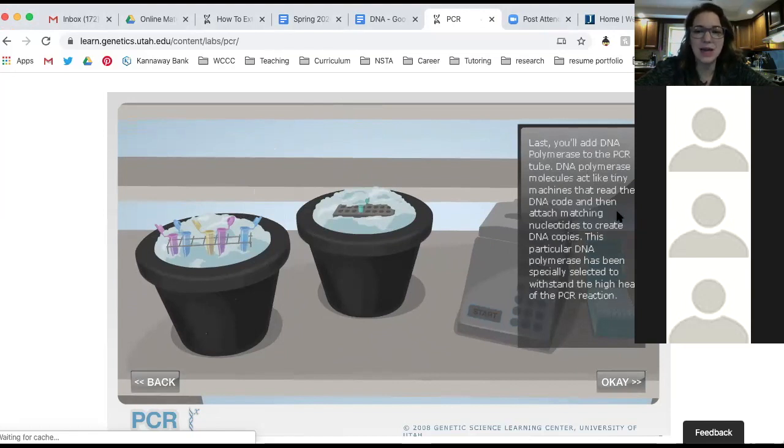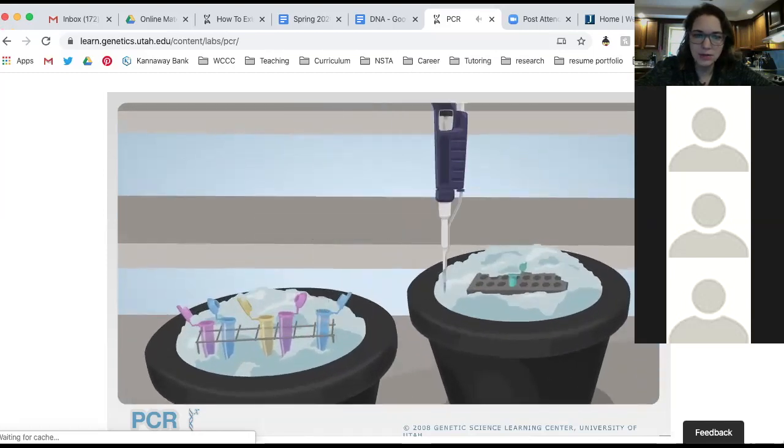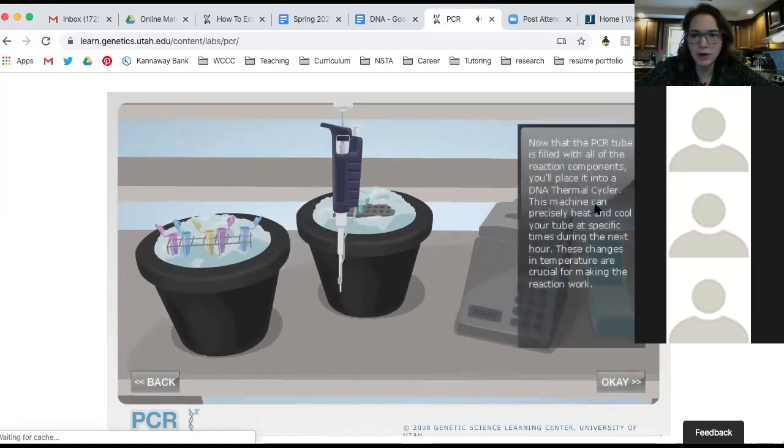This particular DNA polymerase has been specially selected to withstand the high heat of the PCR reaction. It was actually discovered in underwater hydrothermal vents at the bottom of the ocean. They extracted the polymerase from organisms — archaea bacteria — living in those hydrothermal vents, where it's super hot because it's coming up from the core of the earth. That polymerase is the one we use for PCR because it can withstand high heat. So we're going to add our polymerase to our micro tube.